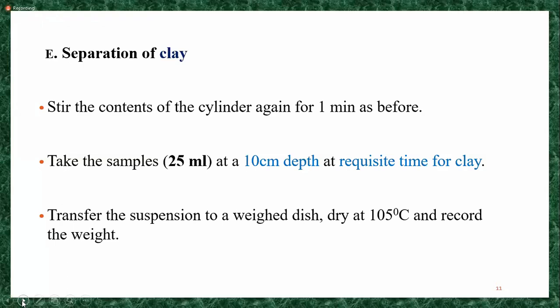Yes, ma'am. Because we are considering the settling time, that's why we are taking the sample in different periods of time. Then you have to transfer that pipetted solution to the moisture can or to the dish, and dry it, and you can get the oven dry weight.